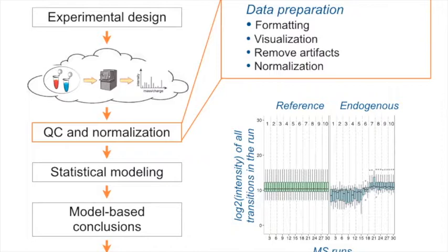In targeted experiments, the usual order of magnitude is a few hundred proteins, right? Those are usually targeted, like specifically targeting a pathway, or you target some things which you pre-screen. So in SRM experiments, it's very likely that more than half of the proteins are regulated. I would not use anything based on endogenous intensities for normalization because you targeted these proteins because you expect them to be changing, right?